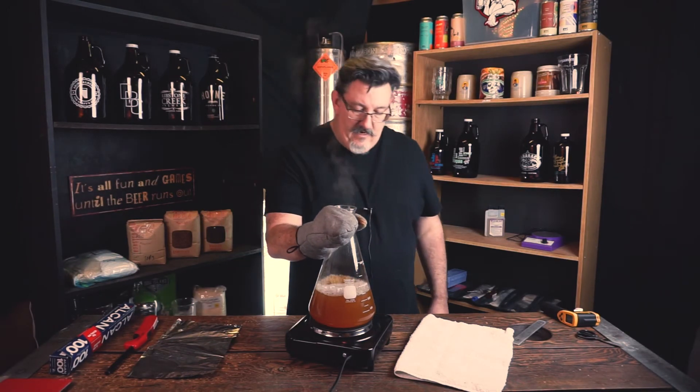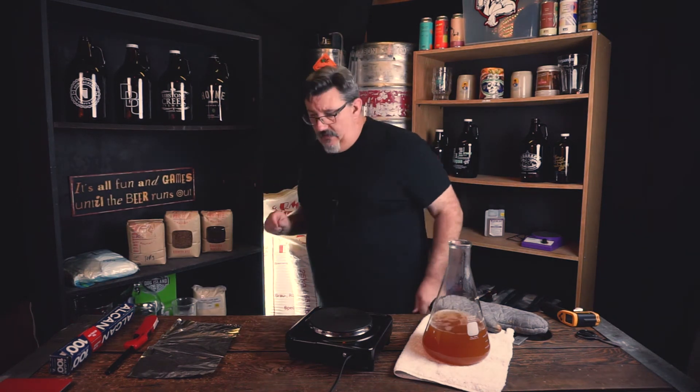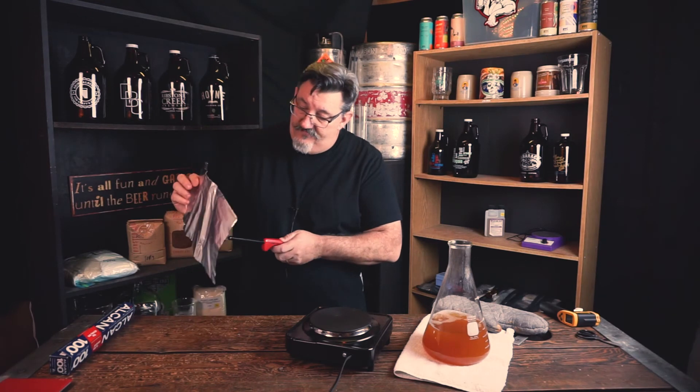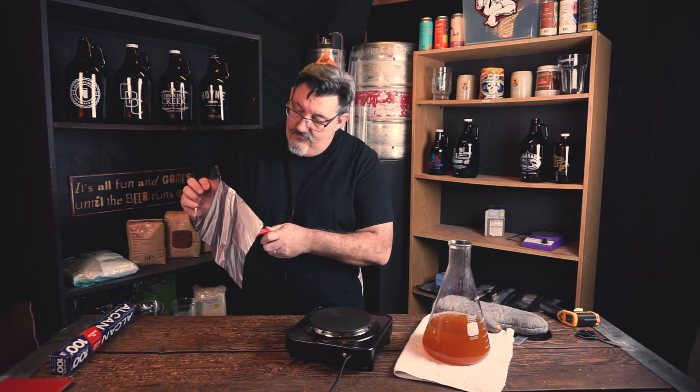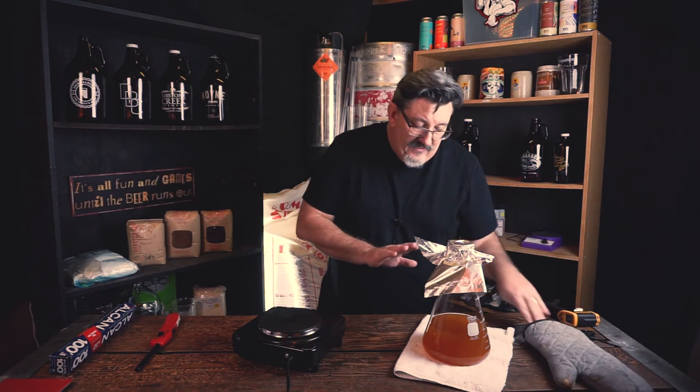We're going to turn this off and take it off the heat now. It's still boiling at the top. We're going to quickly flame the foil and set it over the top of the container. I'm going to gently seal it and leave it — not touching it any further. This is now going to sit and cool until it gets down to our pitching temperature. I'm using Kvike, which likes about 30 degrees. I'll let it get down to about 25, because when I put the Kvike in the volume will come up and the stir plate activity will heat it a couple more degrees, so I want to start a little low.